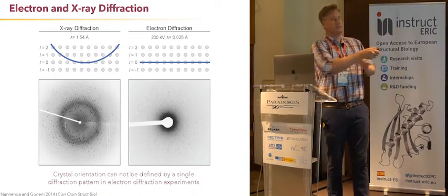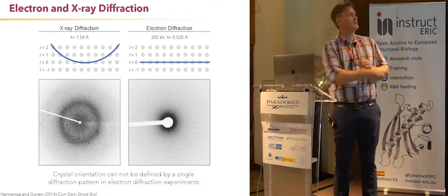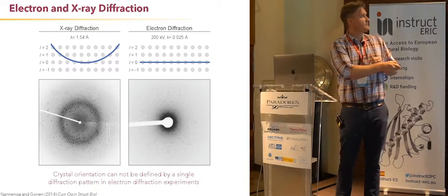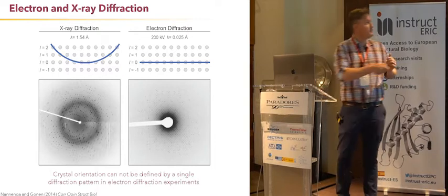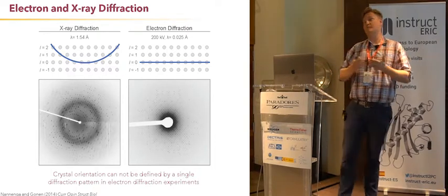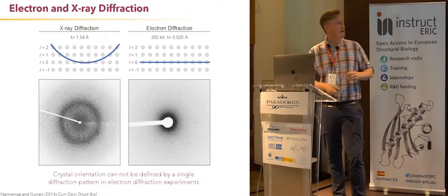This is the Ewald sphere, which is where Bragg's law is satisfied, and that's where the spots will show up in the detector. You're sampling three-dimensional space. In electron diffraction, because the relativistic wavelength is so incredibly small, your Ewald sphere is essentially flat, which means you're doing a really good job of sampling in 2 dimensions, but a terrible job getting 3-dimensional information.